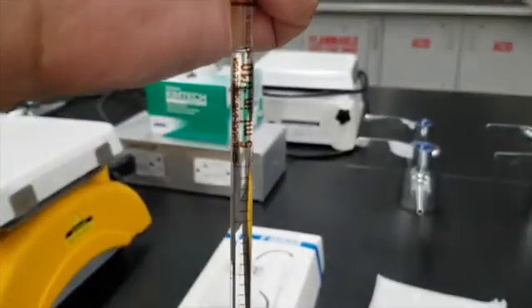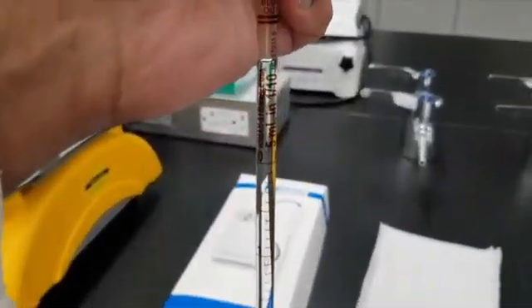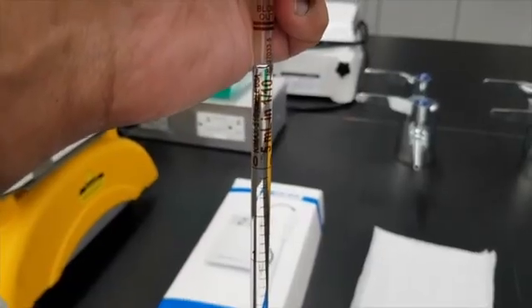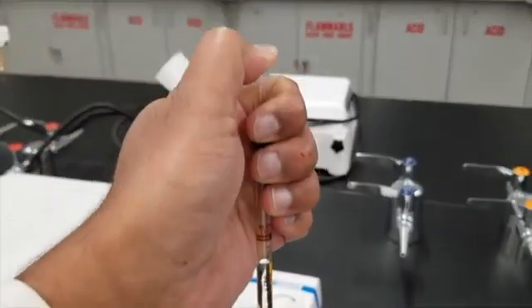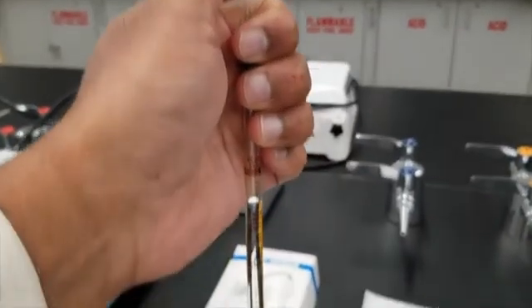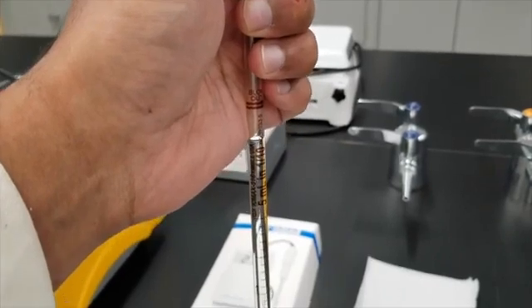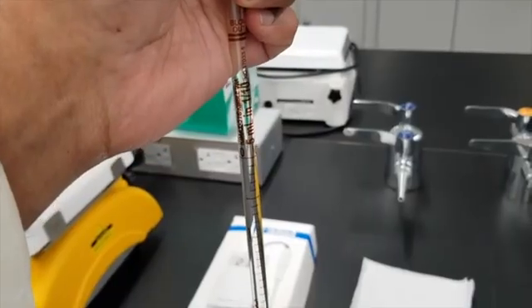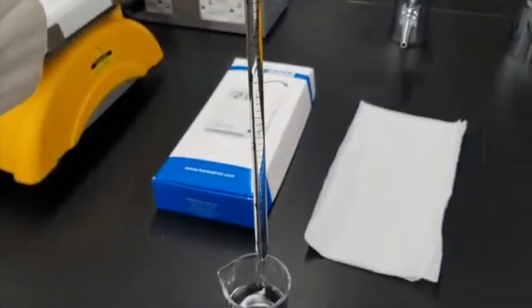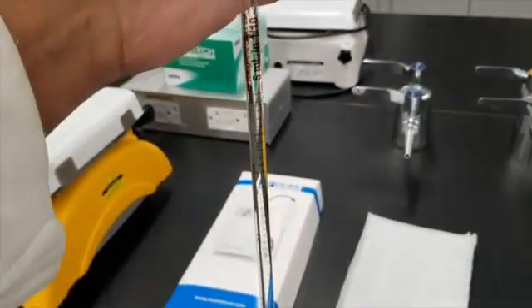So, as you can see here, I've gone past the 0 with my pipette, and so I'm just going to gently ease up on my thumb there, and that will let the water level drop as it lets water out of the pipette. You can see I just gently let water drip out drop by drop.